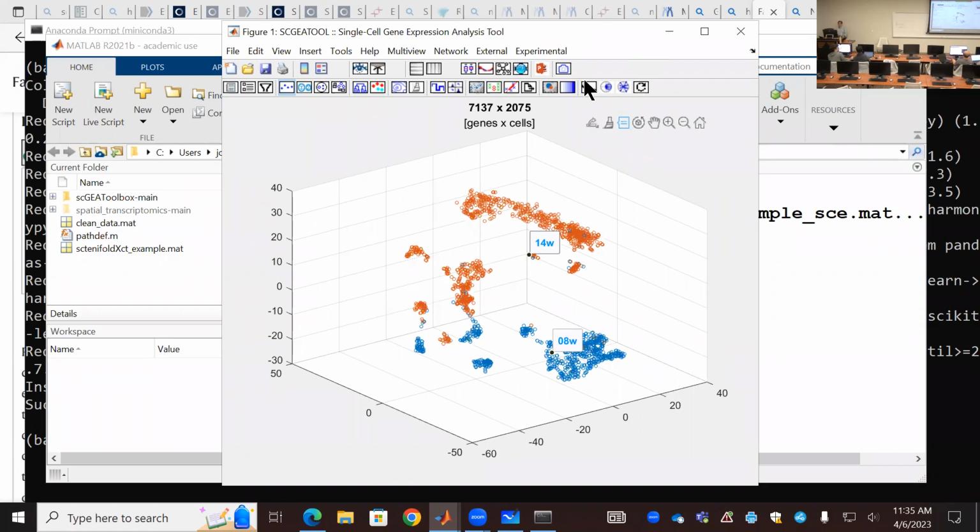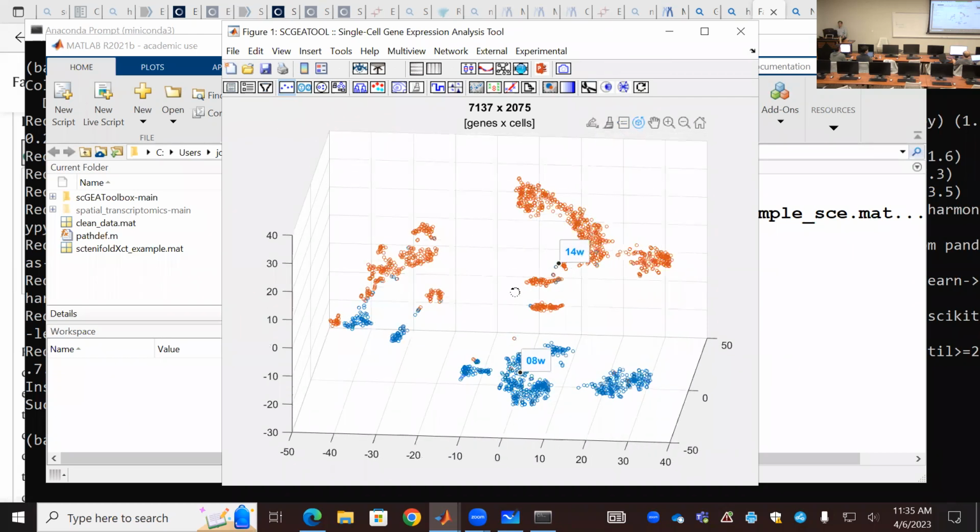Okay, anyway, so I'm going to give this information, the labels of cells in 2 different batches, to Harmony, for Harmony to move the cells if they belong to the same category, same subcluster here. And for example, those cells should be moved close together, okay?